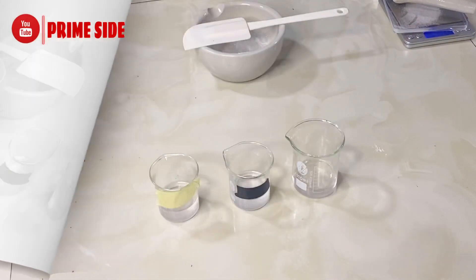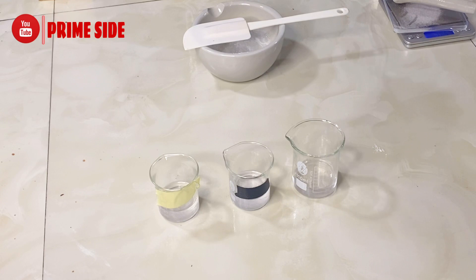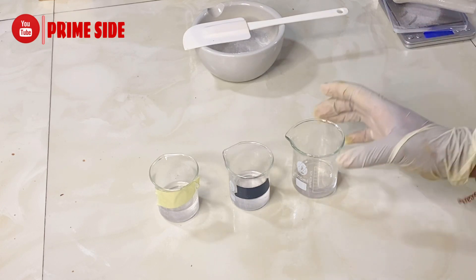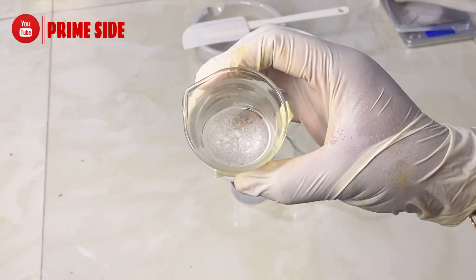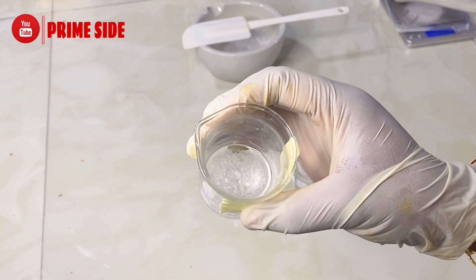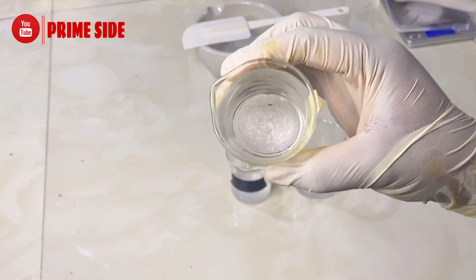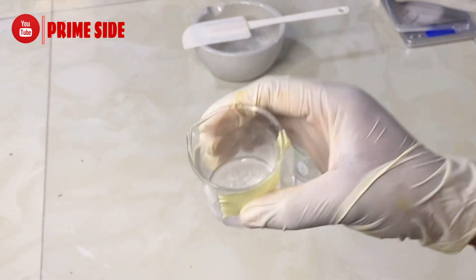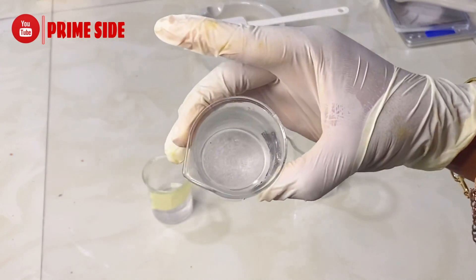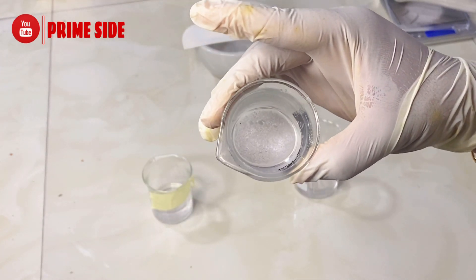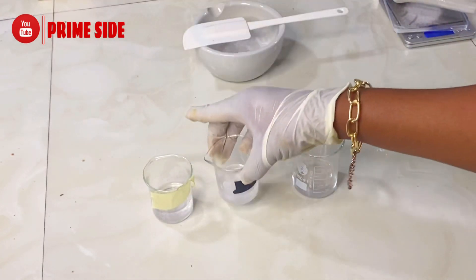So after 15 minutes again, I've come back to check my solutions. This is my solution of salicylic acid with propylene glycol, and as you can see there are still crystals in it yet to be dissolved.